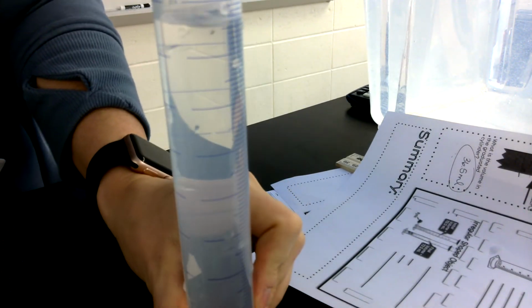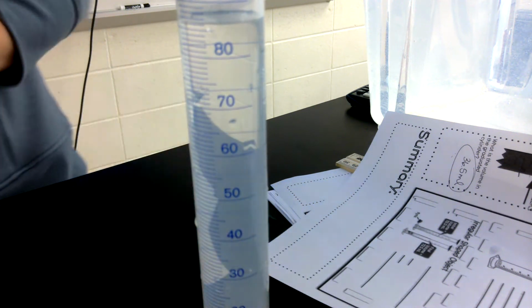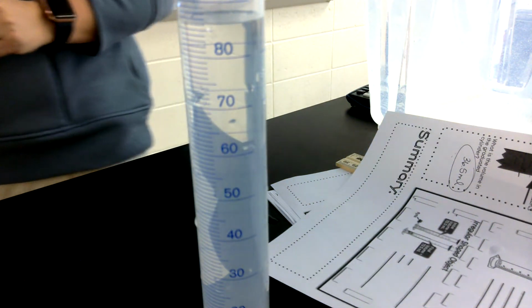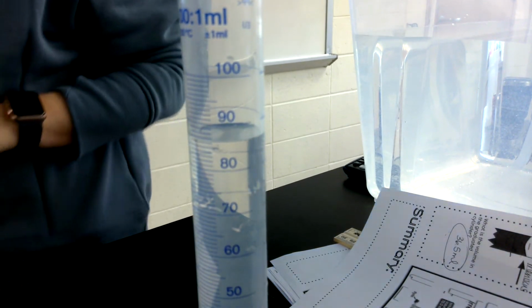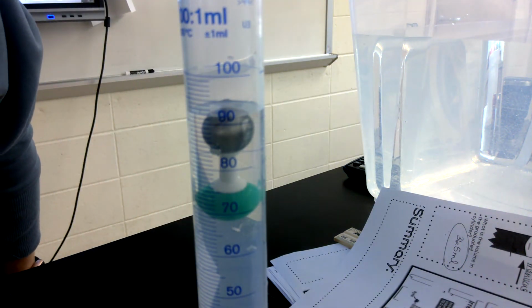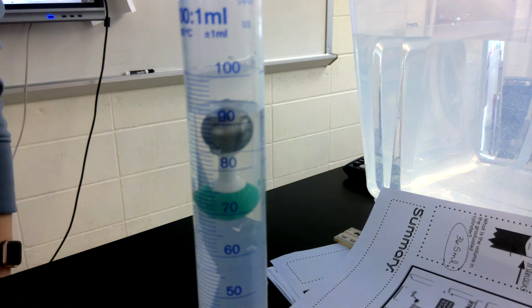Okay, so here is my graduated cylinder. Okay, and what you do is you measure what it is at first, which we already know it was at 86, right? And then, so you get the initial volume, then you put the irregular shaped object into the graduated cylinder, and you measure the new volume, which is now at 92 milliliters. So we went from 86 to 92. So what is the volume of my irregular shaped object?